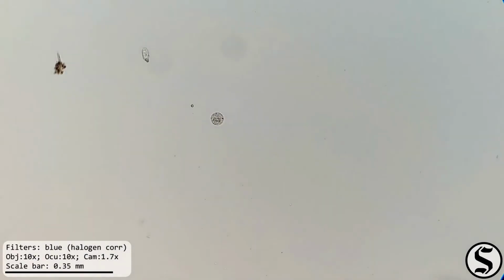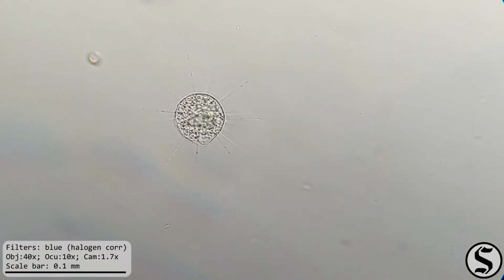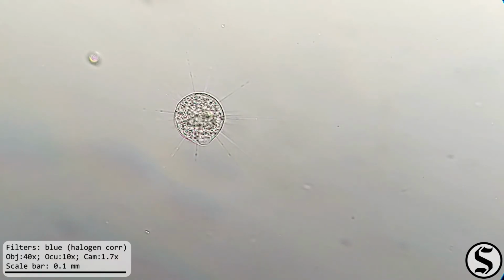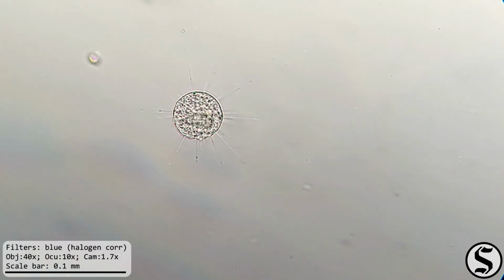And just as I was getting ready to close things up, I noticed this. Well, not that silly, we'll get back to that. But this interesting thing is a heliozoan. That comes from the Greek helios for sun. It's not hard to see why. It's got a whole bunch of rays coming out of it. Those are used for hunting. Oh, look at that. Huh. It just released some kind of vacuole.